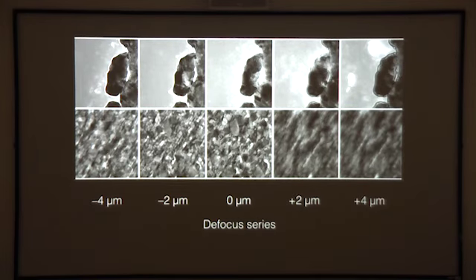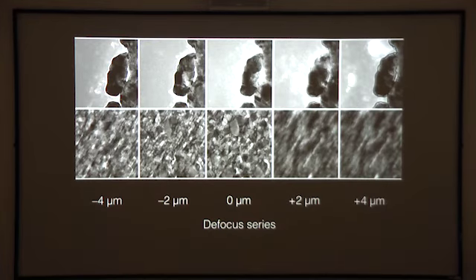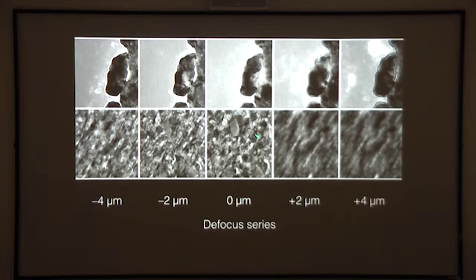And so if you look at a static montage of those images here, at the top is the edge of the hole. And it shows that actually it's quite easy to focus, either using the fringes or using those bright spots. Another way to focus is to minimize the image shift when the beam is tilted, and that's shown on the bottom montage. And this is the method that's used by automated data collection procedures. And again, it works very well on gold because there's so much contrast in these images.